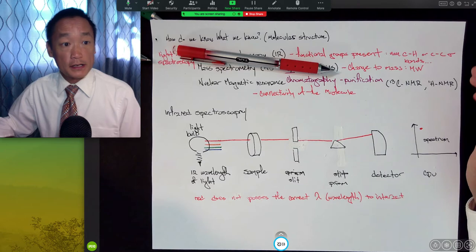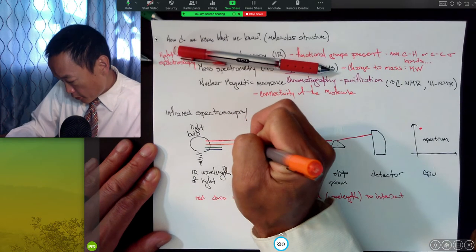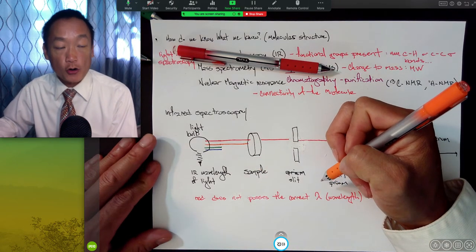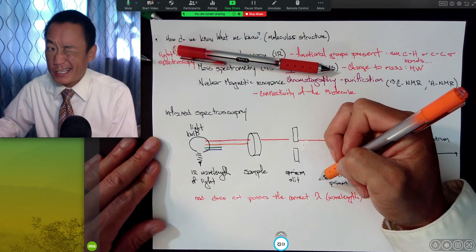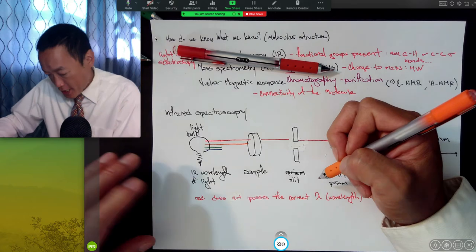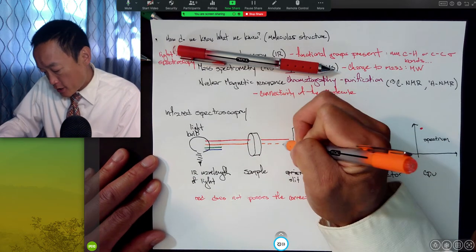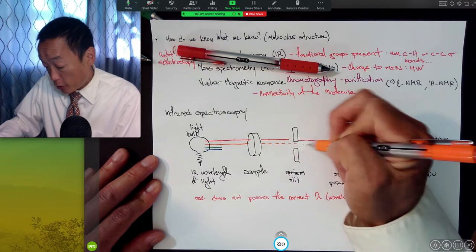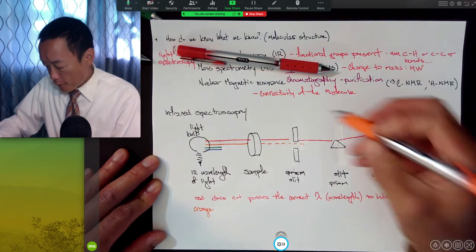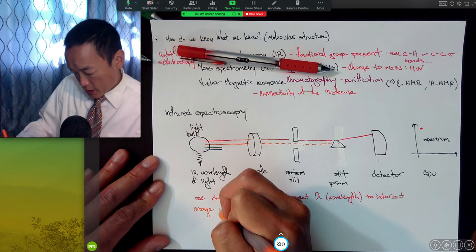Let's say then that as you turn on this light bulb, the orange wavelength of light comes flying through here, and all of a sudden there is a bond in our molecule that is kind of tuned to the right energy. It's not necessarily exact, but tuned to it, such that some of that energy is absorbed by the molecule, and some of it passes through.